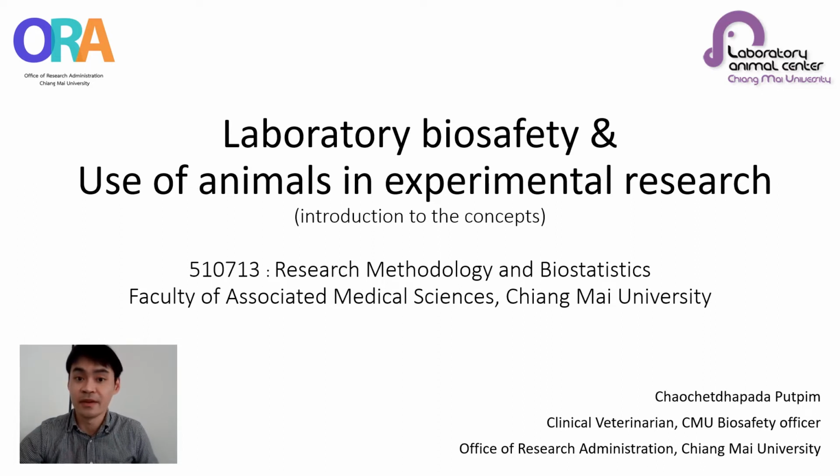The biosafety course can be enrolled via the Safety, Health and Environment Center, CMU. The course is a two-day training. If you pass the testing criteria, you will receive a certificate of achievement.